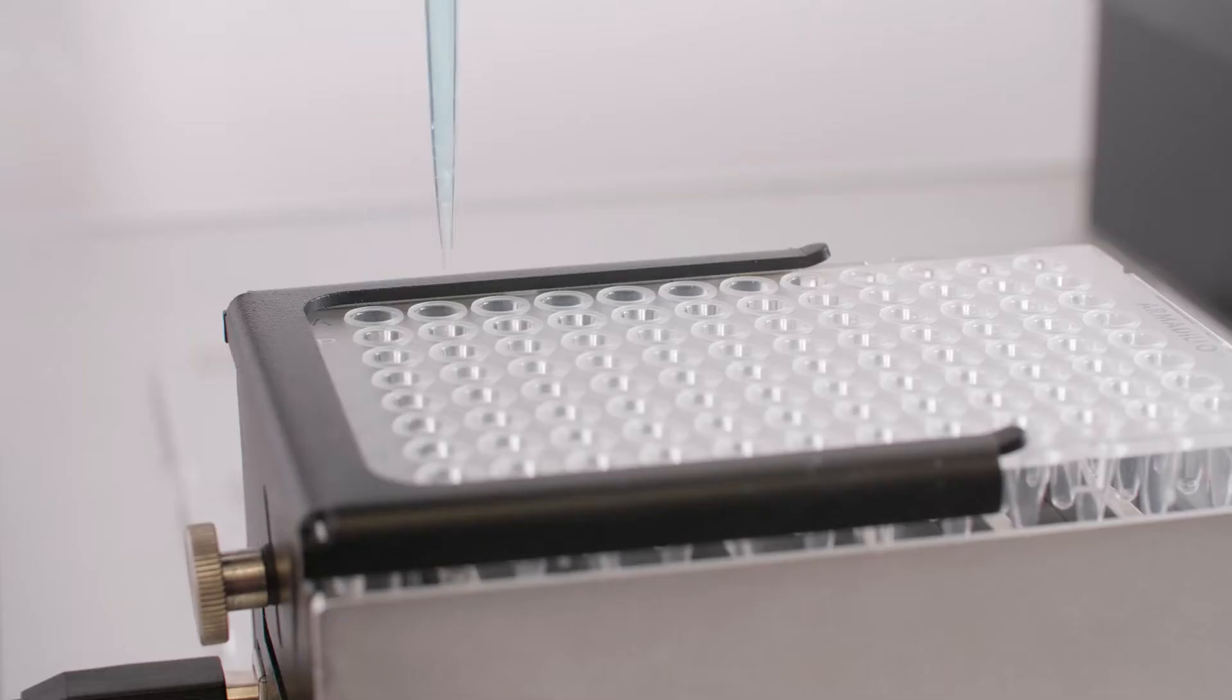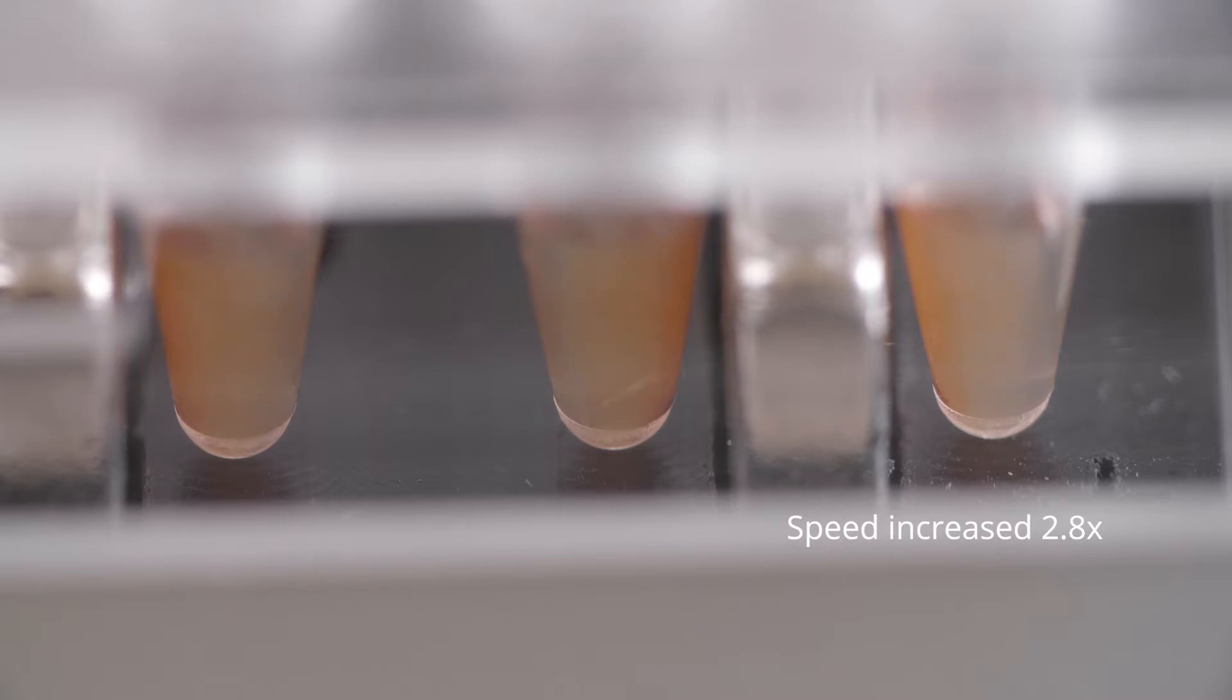Any lab can now easily set up and run nucleic acid purifications like genome extraction, PCR cleanup, and plasmid prep, in addition to bead-based peptide purifications and enrichments.